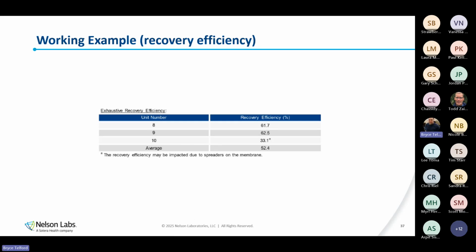So also with that, because that brings up a common question, we do have the bioburden method suitability, which is our inhibition check. And generally that works fairly similar: we're going to test and demonstrate that the product is not inhibitory as tested. Generally speaking, that initial check is going to be sufficient. But if there is a change again to the product, raw material, supplier, something like that, that may be a good time to also reassess that method suitability and make sure that we don't have inhibition.